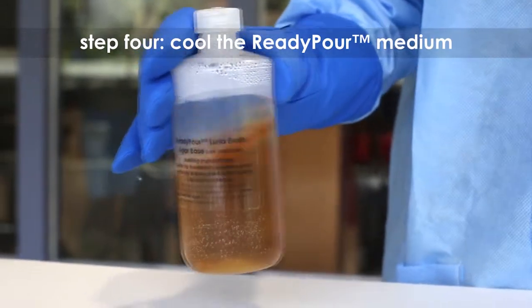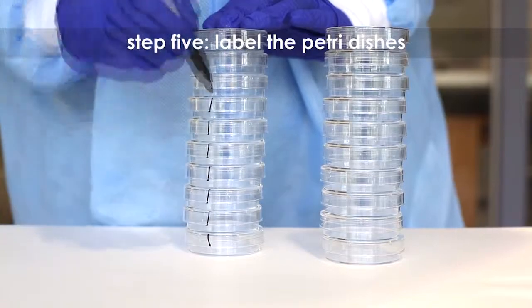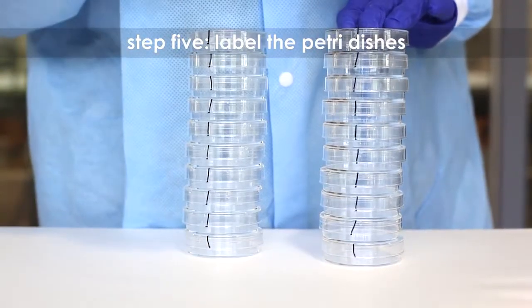Step 4: Cool the ready pour medium to 60 degrees Celsius with careful swirling to promote even dissipation of heat. Step 5: While the medium is cooling, label the petri dishes. Consult your protocol for specific labeling instructions.